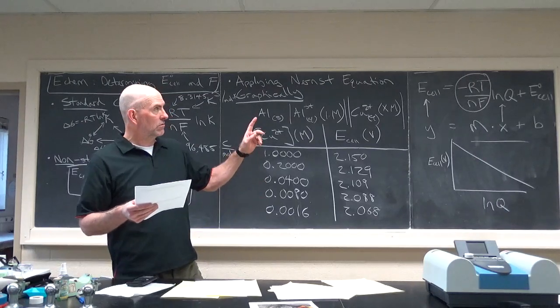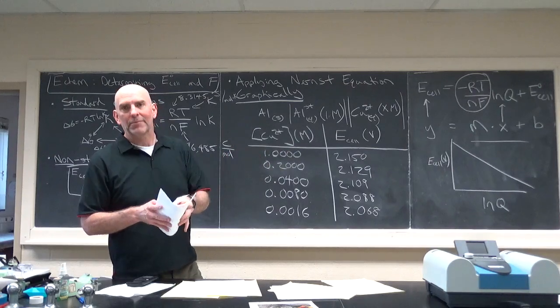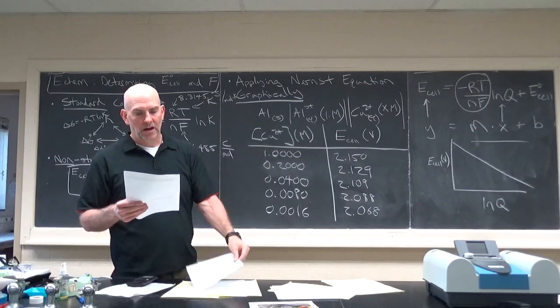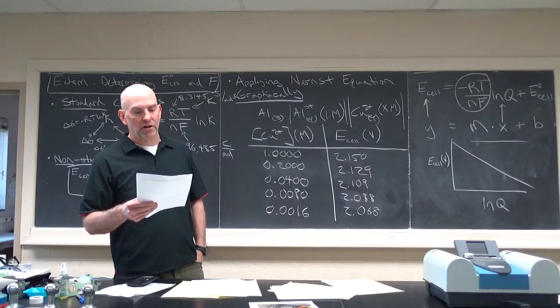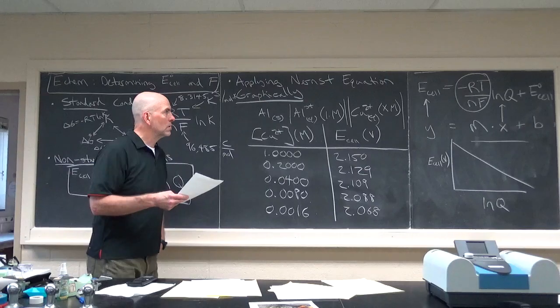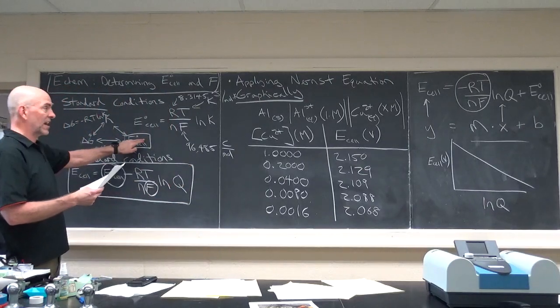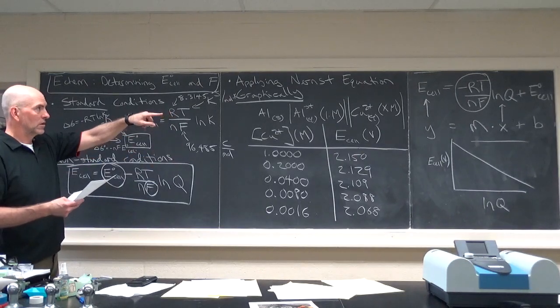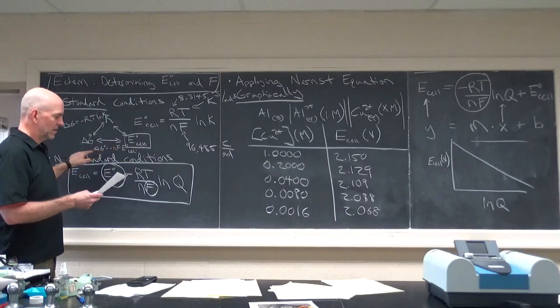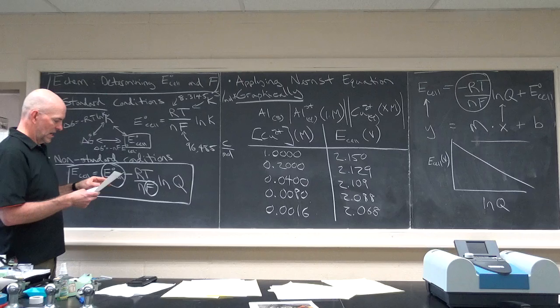So you go to the tables, flip one of them, do all that business, and then you calculate the percent error based on your graphical analysis. I'm sorry, this is quite insulting your intelligence. Then the discussion questions are some of these calculations. Using your results from calculation 2, which is E0 cell, calculate the delta G. Now you have to use the standard cell potential. So calculate delta G, show the units, sig figs. So that's discussion question number 1.